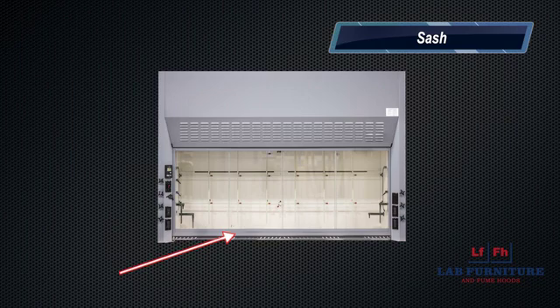For constant air volume hoods, as you raise the sash up, the face velocity drops. As you lower the sash, the face velocity will increase. Depending on how your HVAC system was designed will determine the face velocity of the fume hood.